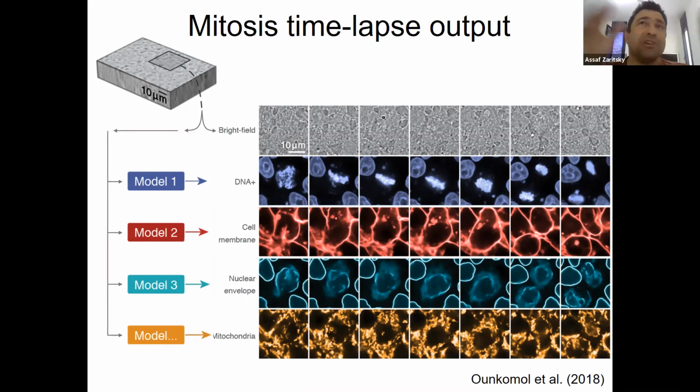And then you do it on a lot of data, and you say, if what I care about is the timing of division, I want to detect the divisions, I can use this in silico. In silico means in the computer. They call it in silico labeling, or synthetic cell. So you can develop a quantitative measure, prove that it's good for this application and use it. People don't do it yet exactly, but next week we'll hear a little more about that.